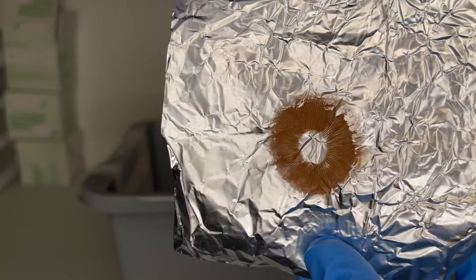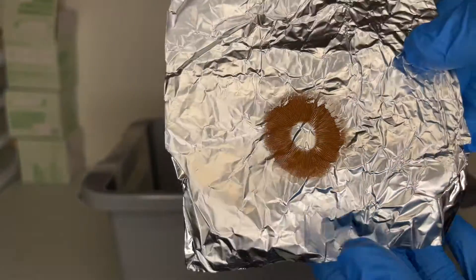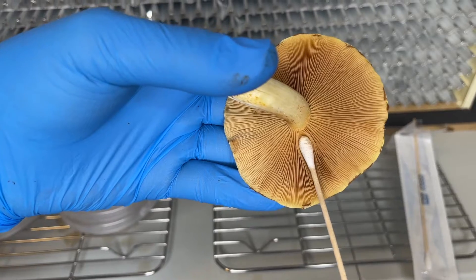Welcome back to Sporenspro. In this video, I'm going to show you two different ways to collect mushroom spores: the first being a spore print, and the second being a spore swab.